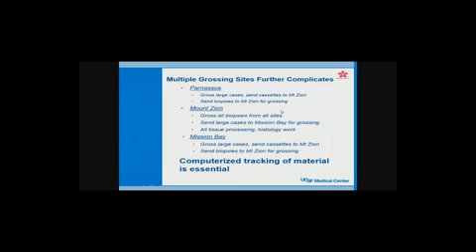Now, with the barcoded blocks, we scan the block, the stain list appears on the screen, the labels print out automatically, they apply the labels to the slides, and then they put the slides in the rack, and that's it. There's no paper involved at all. Okay, and then our problem two is that we have multiple grossing stations.